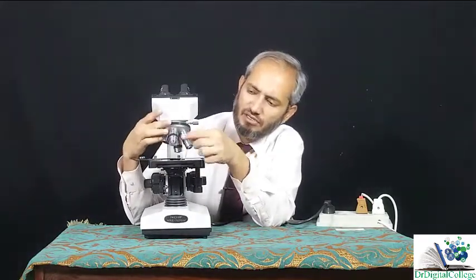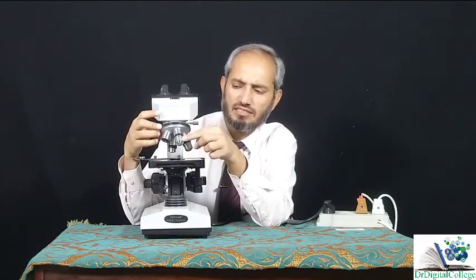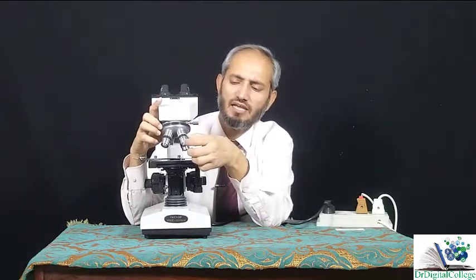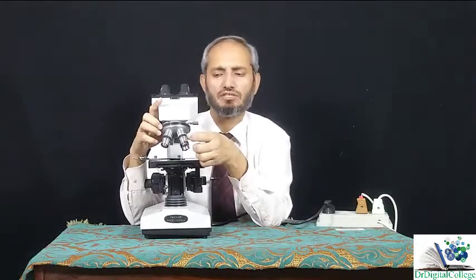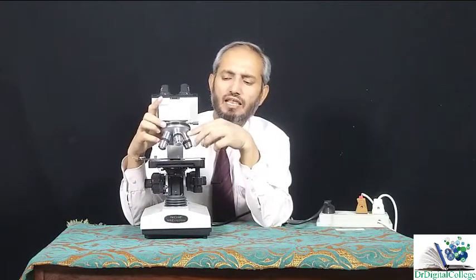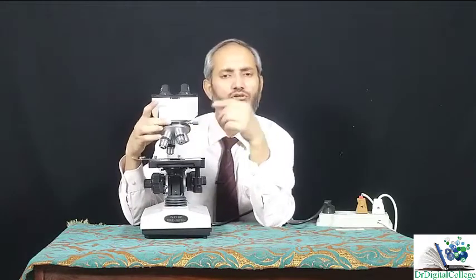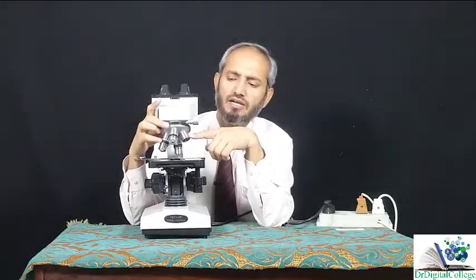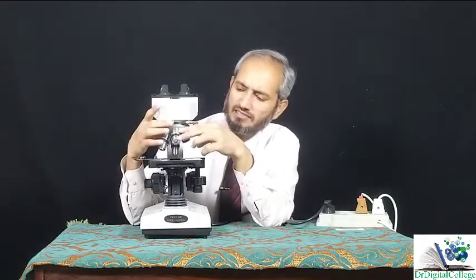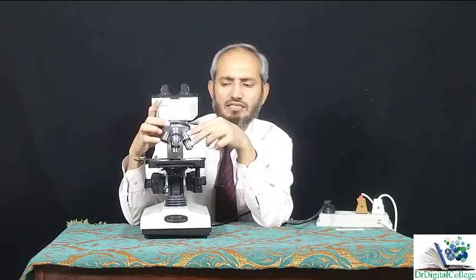Then here is blue. This is 40x. The length of this 40x is even bigger than that one, yellow. And the largest one is this white, and this is of 100x magnification. Okay, magnification is proportional to the length of the lens here. Smaller the length, lesser the magnification. Bigger the length, more is the magnification. So red is of 4x, yellow is of 10x, blue is of 40x, and this white is of 100x.